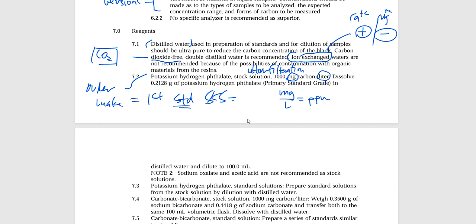All right, so that is not an N. It is an M, Tracy. Make sure that your chicken scratch actually is legible. That is one of the violations of a quality lab environment. Make sure people can read it. Okay, so ppm, there we go. All right, so milligram per liter, parts per million.